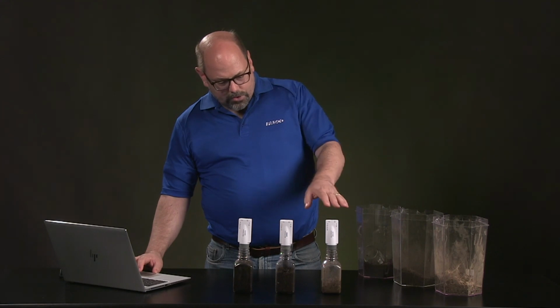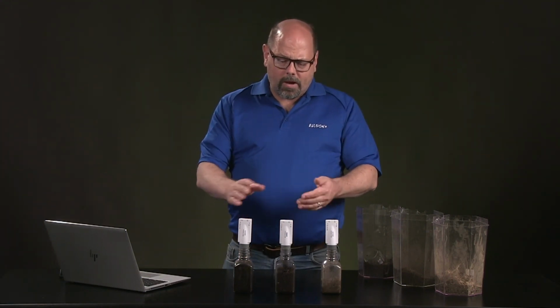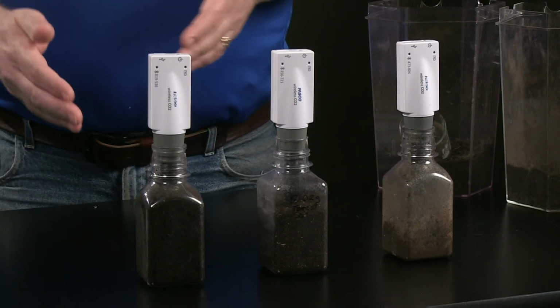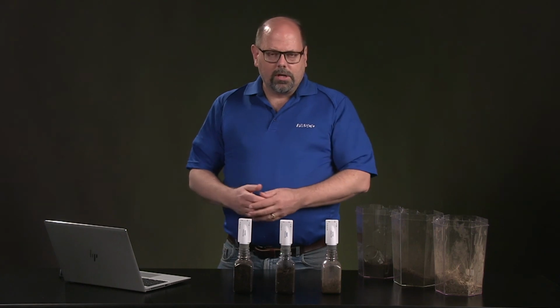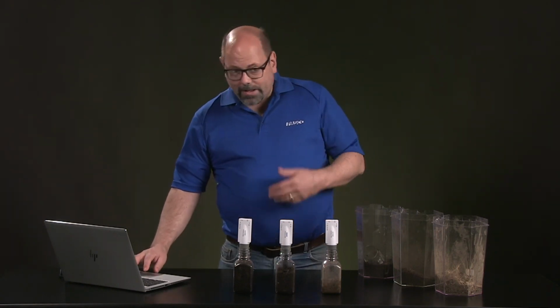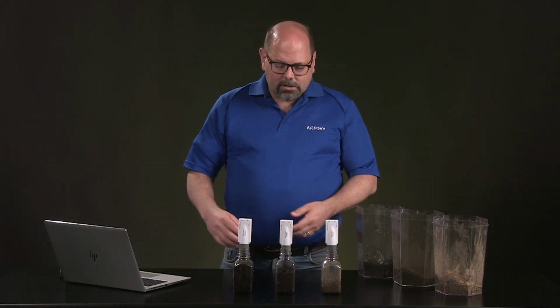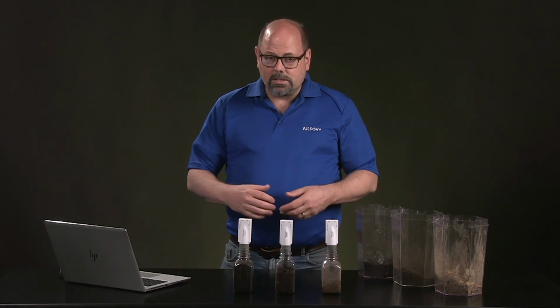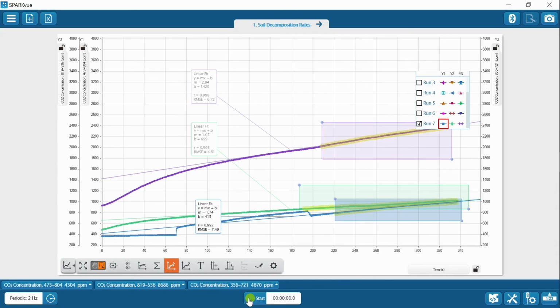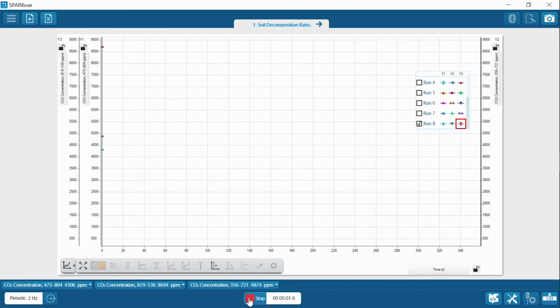What we're doing is, we still have these connected. In between each session, because it's been long enough, like overnight, for instance, we've reconnected these. I made sure I paid attention to which order they came in, to make sure that we were getting the data from each of the soil types. And that's something you'll have to think about when you're designing your own experiment: making sure each of these instruments is giving you the data that you'd want. But let's go ahead and run this for another minute, and we'll get our last run.